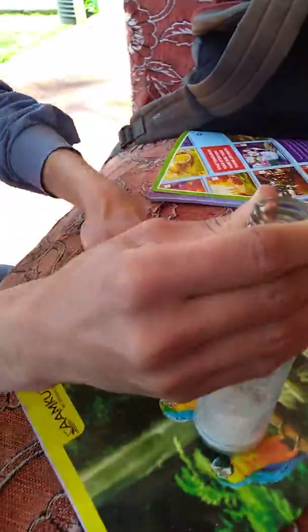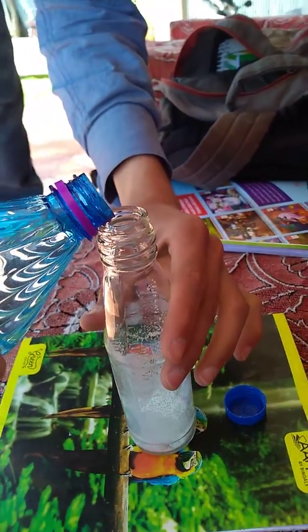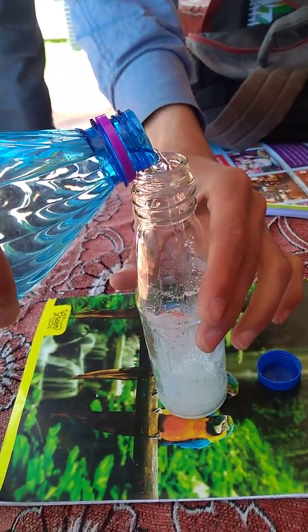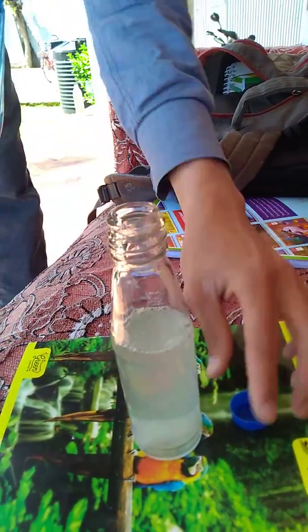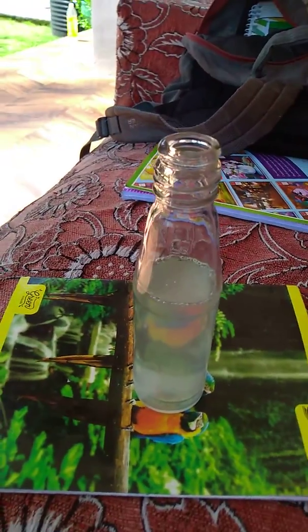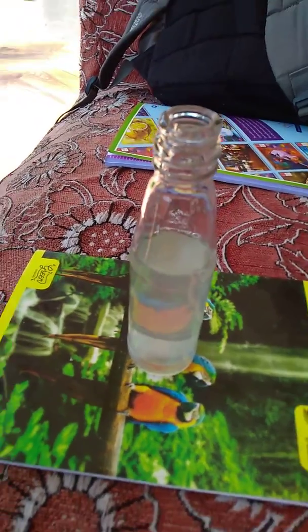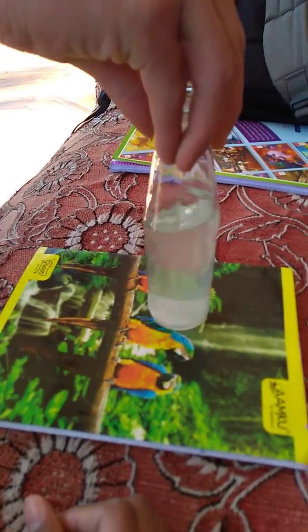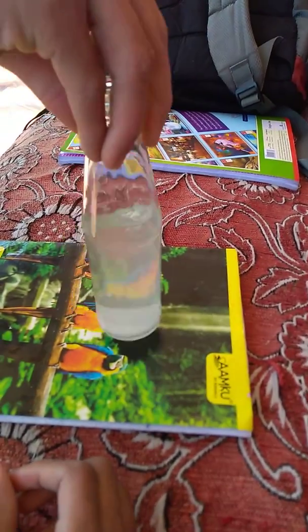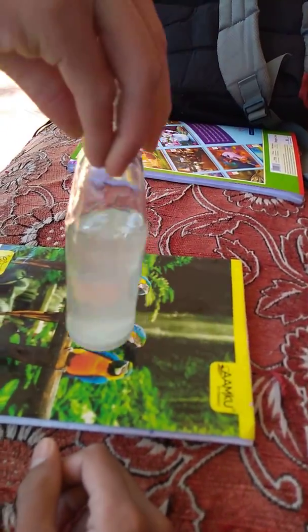Now we have put it in. Let us put this dilute sulfuric acid in — this is very, very dilute. The reaction will take place in this: hydrochloric acid will be formed, and sodium sulfate also. That sodium sulfate will be dissolved in this.